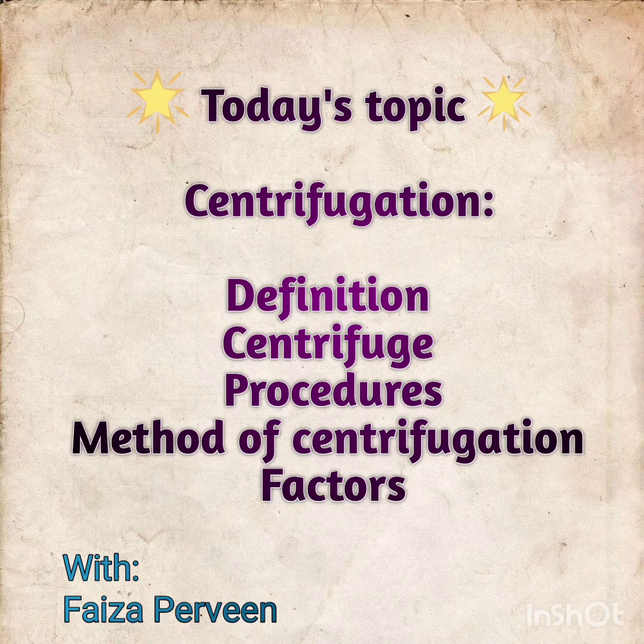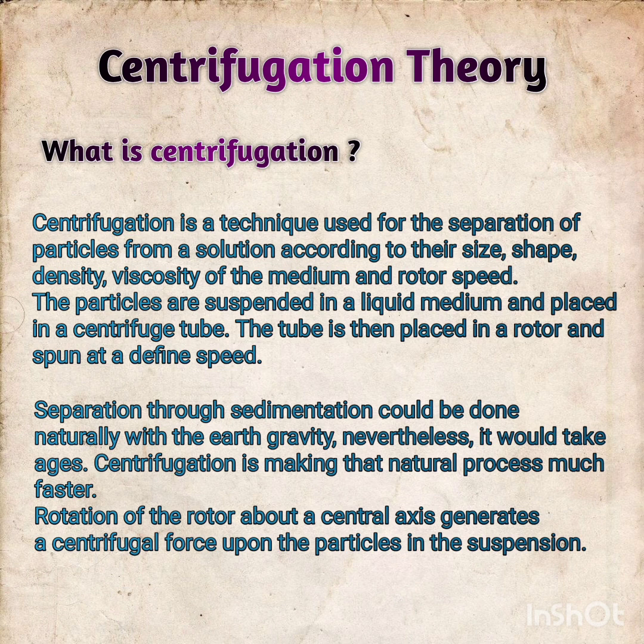Let's start our lesson. Our first slide is about centrifugation theory. So, what is centrifugation? Centrifugation is a technique used for the separation of particles from a solution of any type, according to their size, their shape, their density, their viscosity, and the rotor speed. The particles are suspended in a liquid medium and placed in a centrifuge tube.